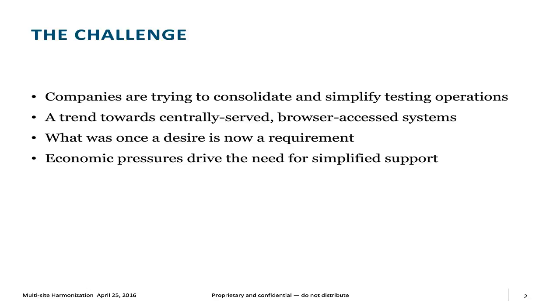So back in the early days, the history of LIMS, if you look at the genesis of LIMS to begin with, in the early 1980s, Beckman Corporation came out with one of the first LIMS systems. And LIMS systems were generally devices to try to trigger instrument sales, things that they had very well measured and understood margins for.